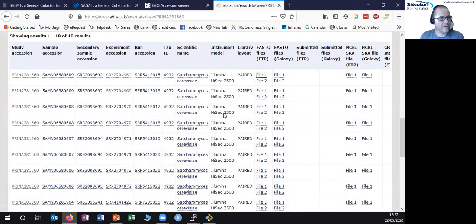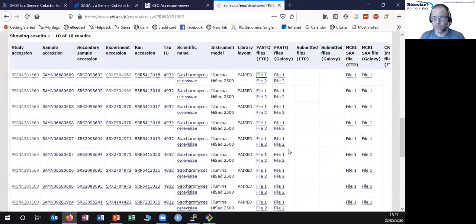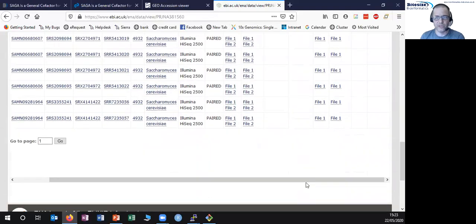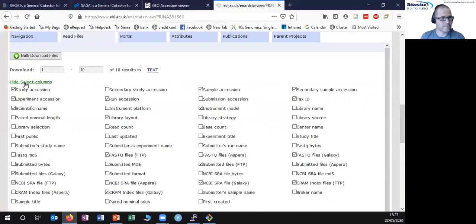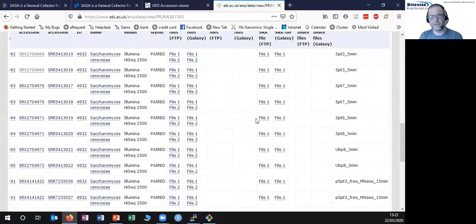There are some quirks here — you see all these accessions: primary accessions, secondary accessions, run accessions, all the things we were talking about. Weirdly, they seem to have decided that the one thing you don't need to see on this table is the actual sample name. So although you've got all of the accessions, you don't have the name they were submitted under. If you want to see the sample name, you need to go to 'Select Columns' and turn on 'Sample Title,' which then actually tells you which sample is which. A bit of a faff.